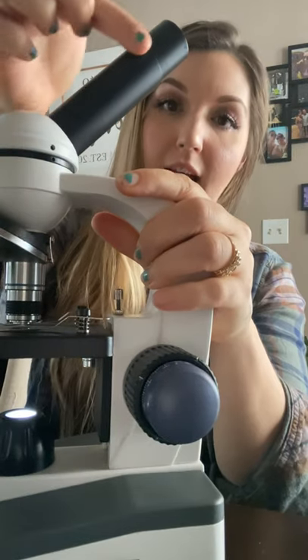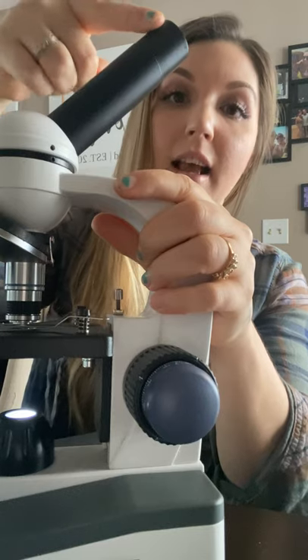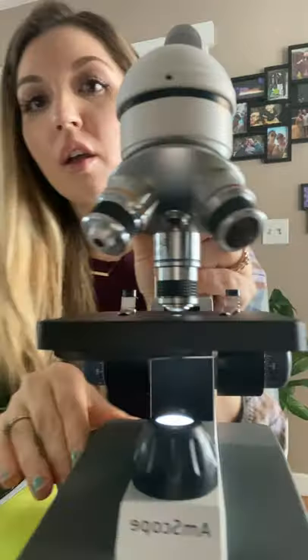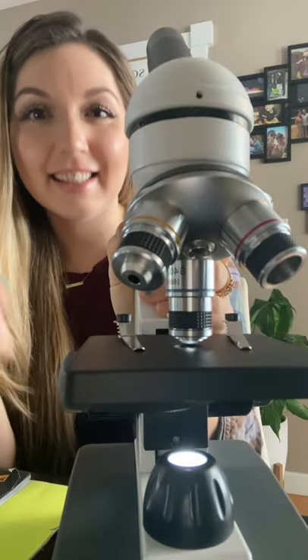This right here is the head of the microscope and this is the ocular lens. This particular ocular lens is 10 times magnification. We also have one that is 25 times but we are not using that in today's video.